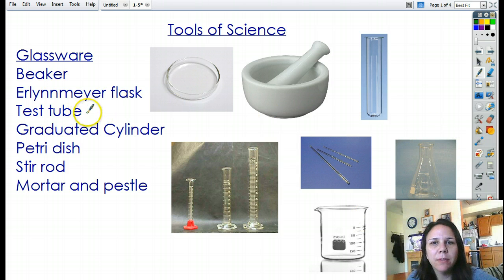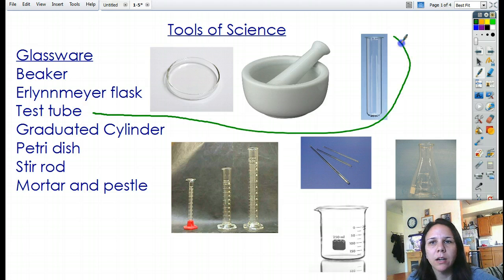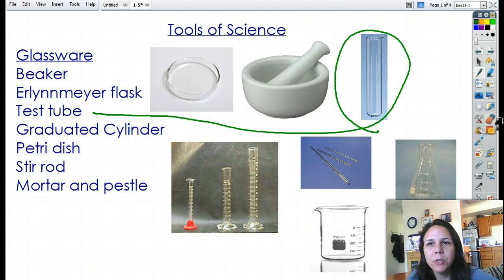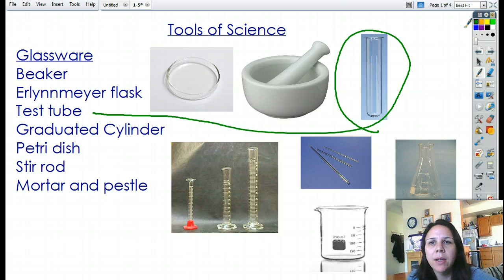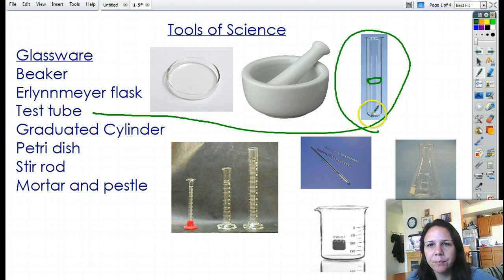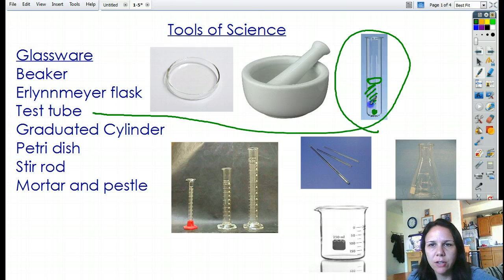Test tubes come in glass and are easily broken, so you've got to be careful. Any of these things — if you break them, you buy them. These are really good for doing small scale experiments. You can put something in here, fill it up with water or a chemical indicator, see if it changes colors, and that'll tell you something.